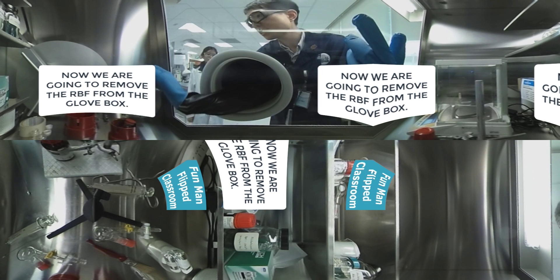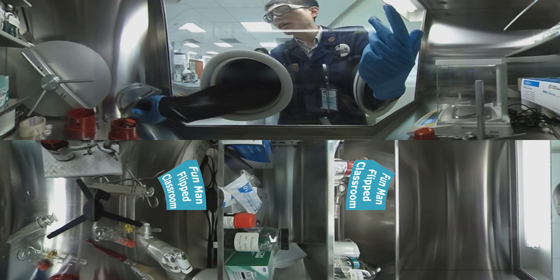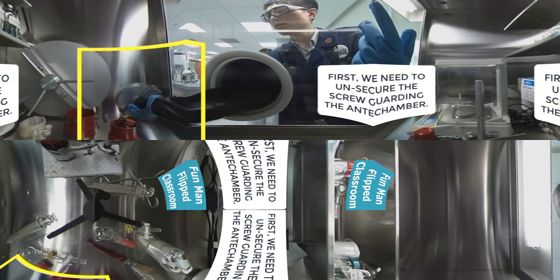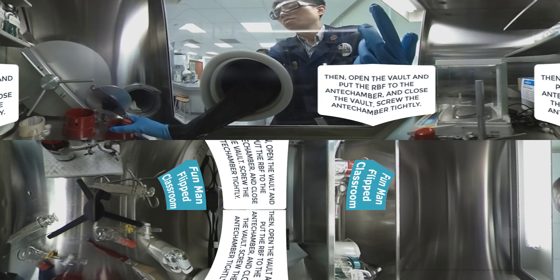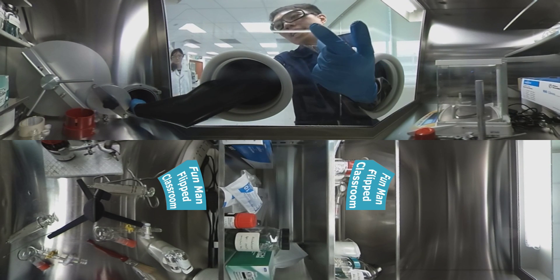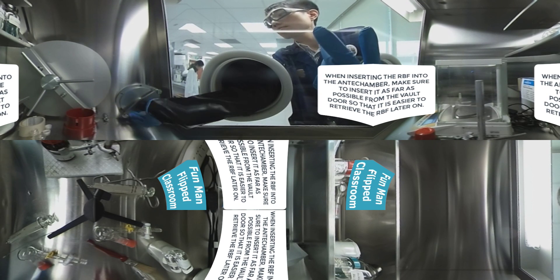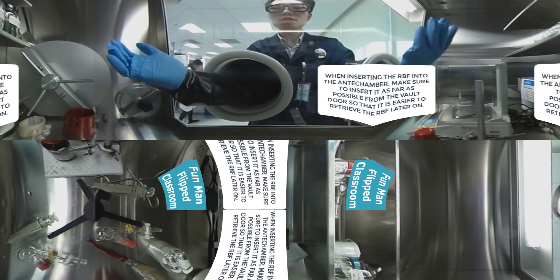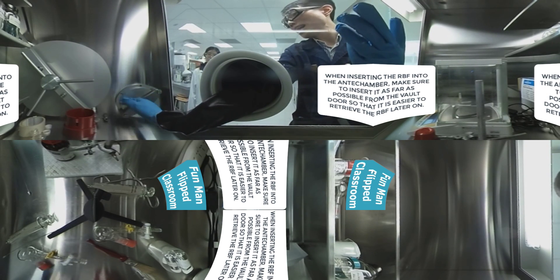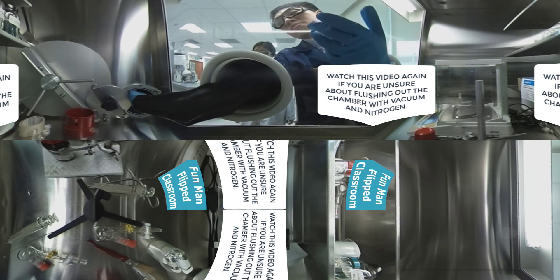Next I am going to remove this RBF from the glove box. Remember to unscrew the screw guarding the anti-chamber, otherwise you can't open it. After it's been unscrewed, open the vault, reach the anti-chamber, close the vault, and screw it tight. Now I'm trying to push the RBF as far in as I can so it's easier to take it out from the anti-chamber when there's the flushing motion of vacuum and nitrogen gas.